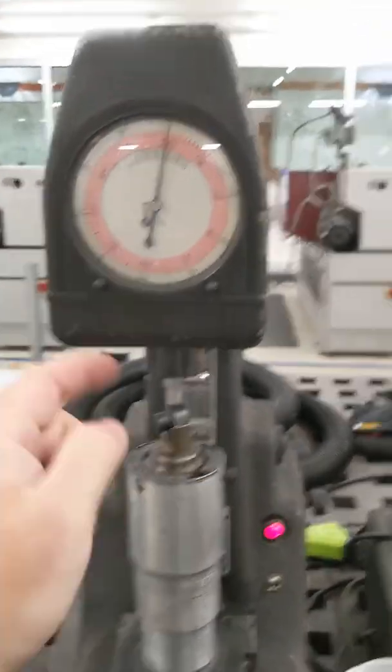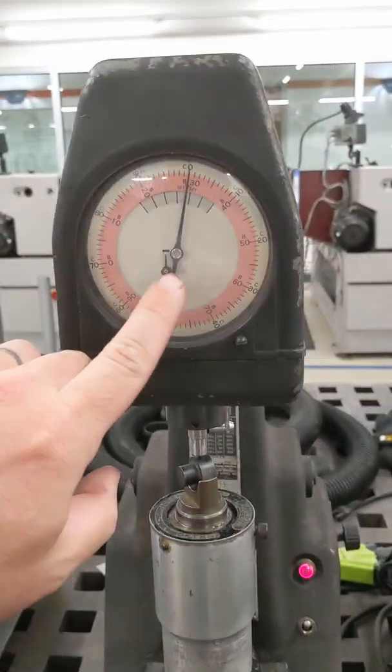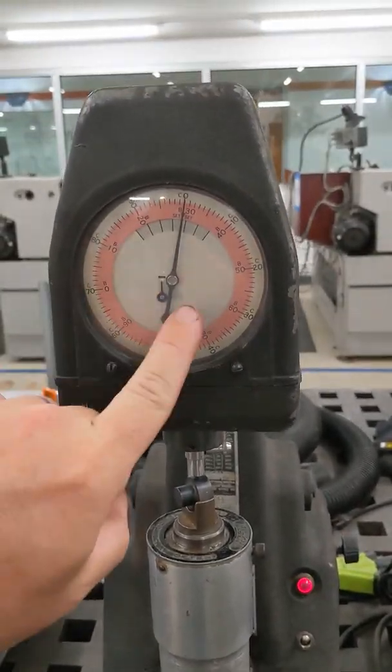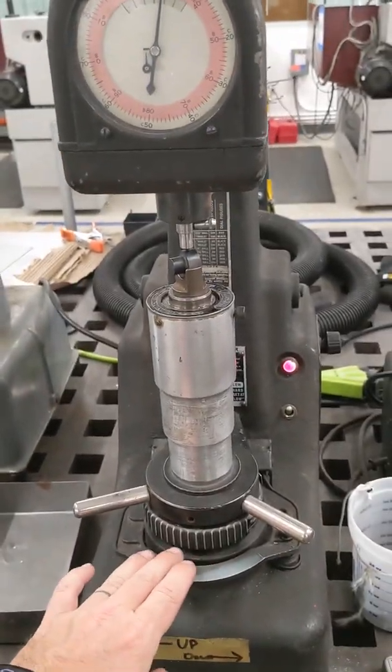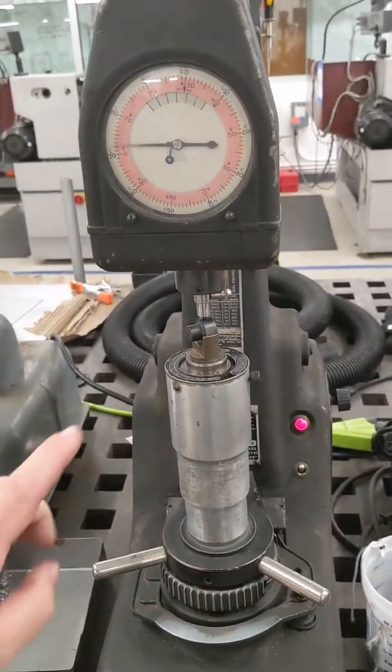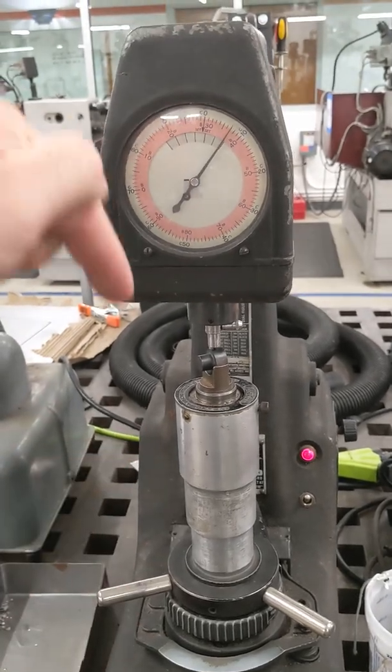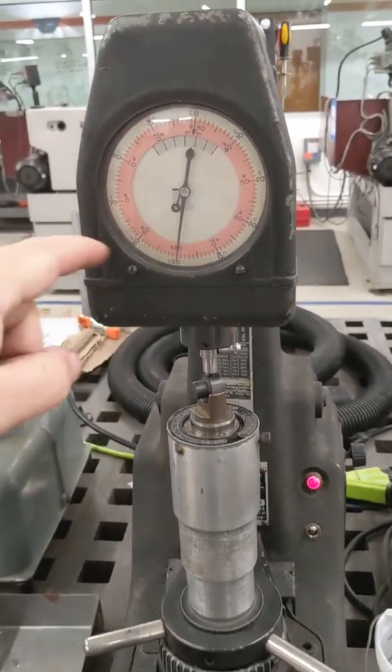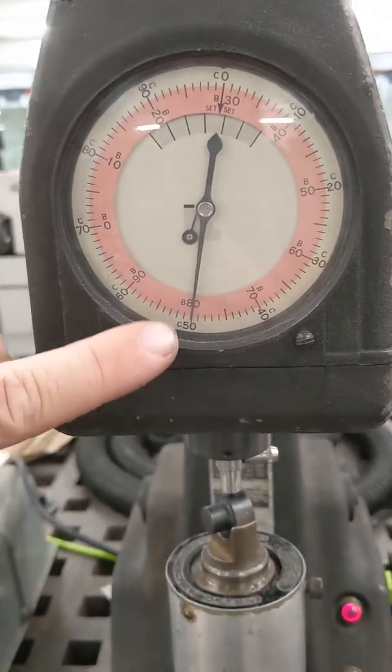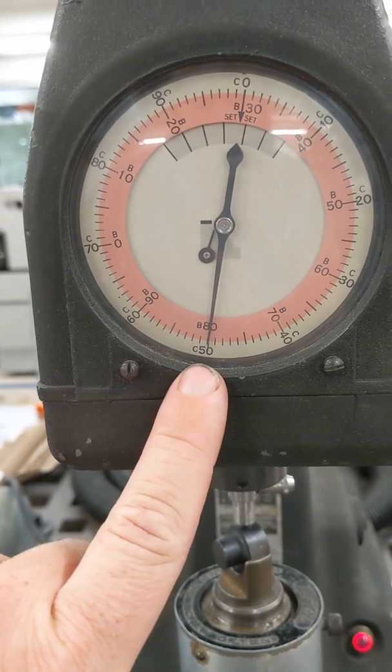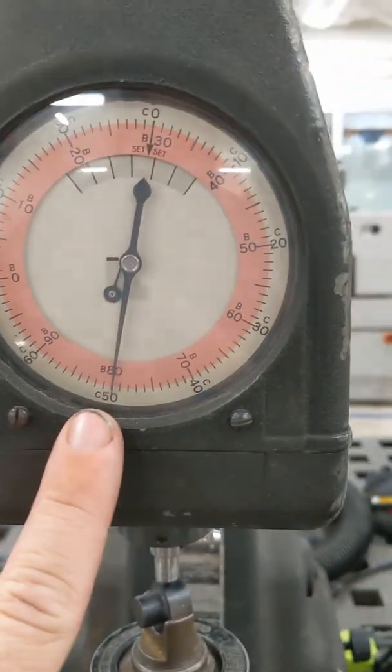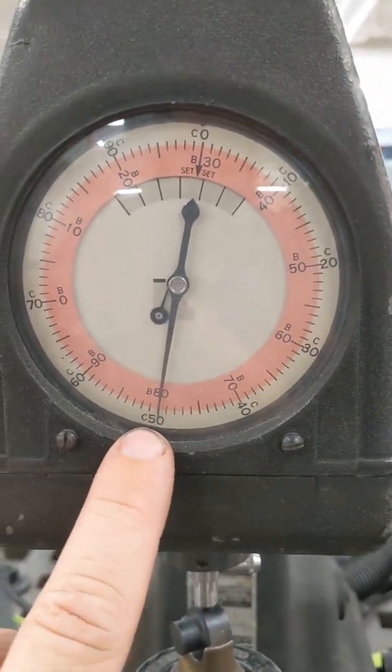Once the sample is placed up against the indenter, the little needle is pointing straight up, and we've zeroed the scale, then you press down once on this little paddle and the machine performs the test. It applies additional load to the part, and when the needle springs back, this is the number that we read to get the hardness measurement. This part right now is reading a hardness of Rockwell 50C.